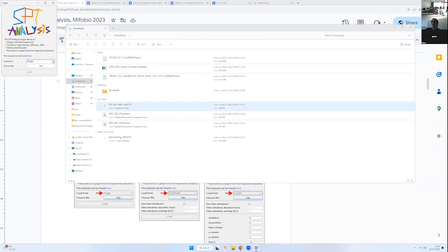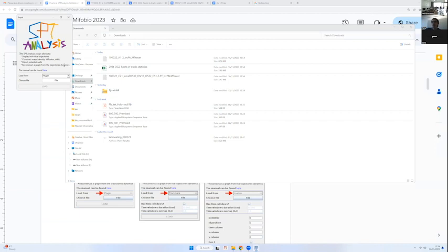All right, now we have the data here. The first thing is, this is the first window that you get, the input window. There are 3 options to load files. Either you can load a file in plugin format, which is something we will discuss after, a file format you can save from the plugin. Or you can directly load files from TrackMate, or you can load a file in custom format. For example, we can start with custom format. Custom format means you have 1 spot per line of the file, and the different columns will tell you different information.